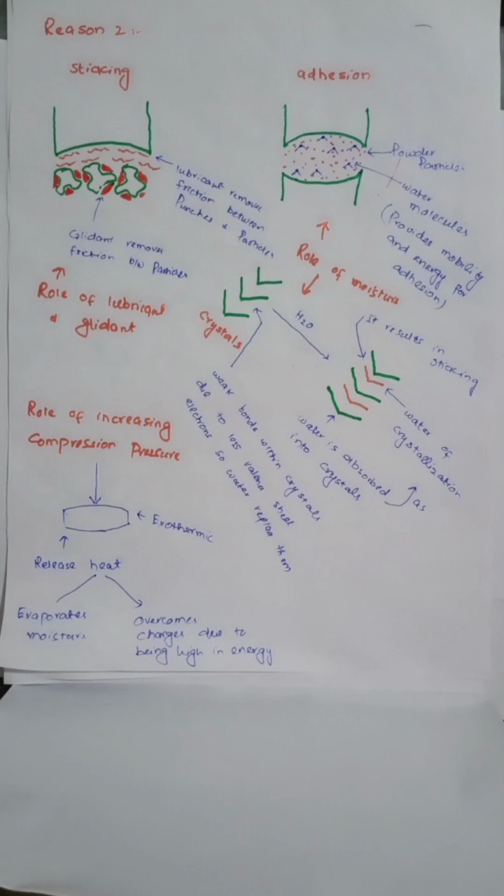Another reason for sticking is the lack of lubrication. When there is less quantity of lubricant or glidant within the powder, then it will also result in sticking. Let's suppose the lubricant does its work in such a way that it forms a layer between the punch and the powder surface.